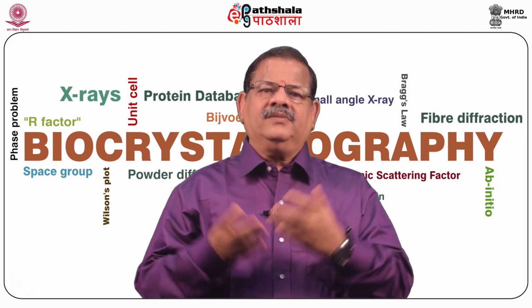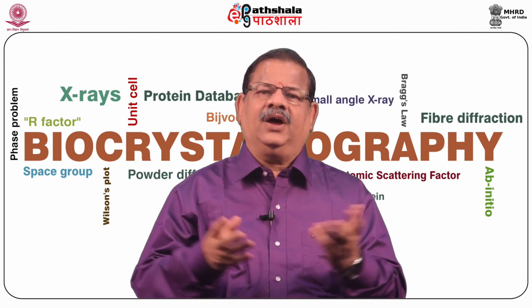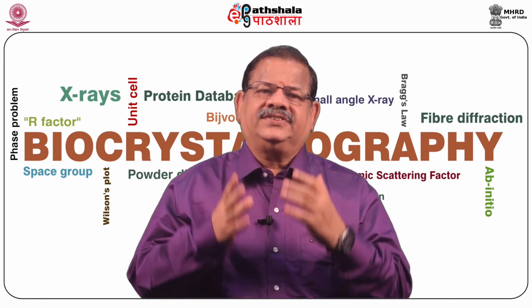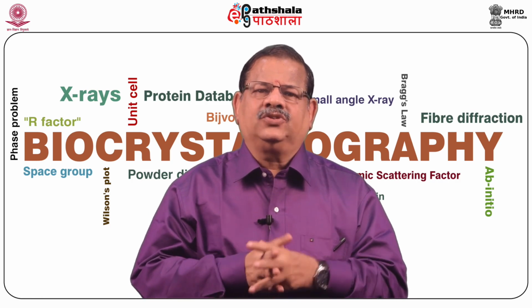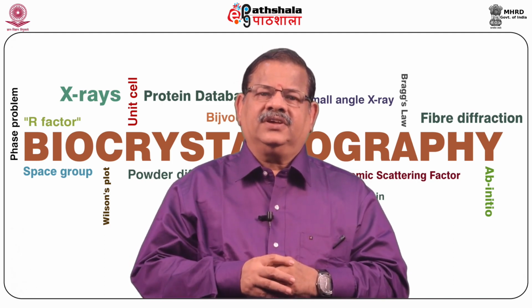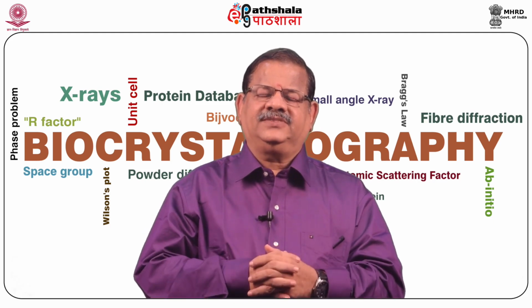CCP4. What do you mean by CCP4? It means Collaborative Computational Project number 4. And it's a free software. Anybody can download it into the computer and use it. It's user friendly. And this is a program suite which is an integration of a set of programs in protein crystallography written by many scientists, and which includes a large number of very useful tools developed by these scientists around the world. The programs which are available as supporting modules in CCP4 are listed below with the name and the purpose for which each program is useful.